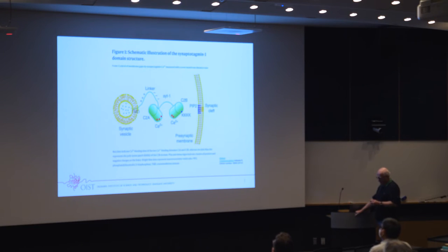All right, so we've been interested in finding out what synaptotagmin actually looks like in there. It's not very big, so we were not sure at first whether we could see it. To make a short story even shorter, this is a caricature of it. So you have the synaptic vesicle, the two calcium-containing, or could-contain-calcium, peptides of the synaptotagmin, which is the sum of these two, and then binding to the synaptic cleft.